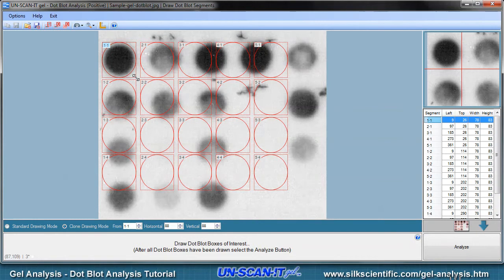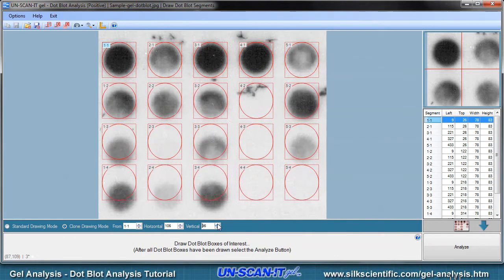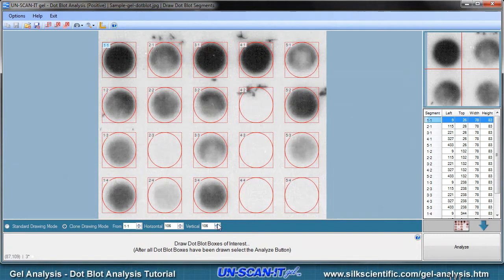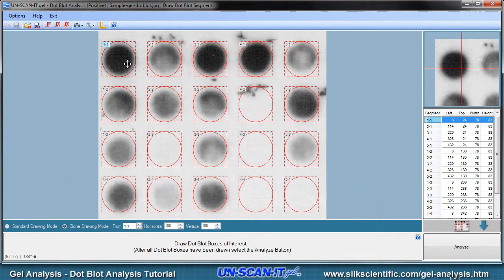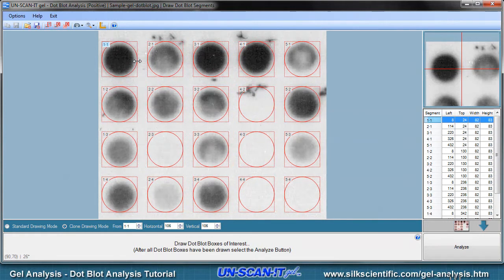The clone drawing feature will then create the other segment boxes automatically. You can choose the horizontal and vertical settings at the bottom of the image window to adjust the spacing of all the segments to get the segment boxes spaced properly. The boxes can be resized or moved by hovering the mouse over the box and dragging, or by editing the values in the spreadsheet at the right side of the screen. If clone drawing mode is selected, all the segment boxes will move and resize together. If standard drawing mode is selected, you can move and resize the segment boxes individually.